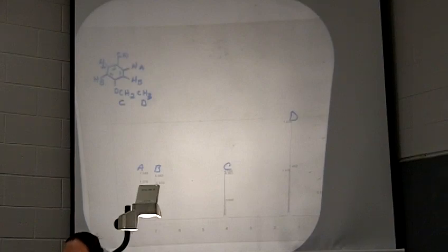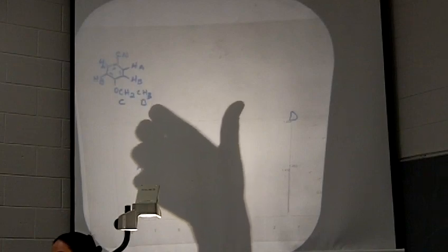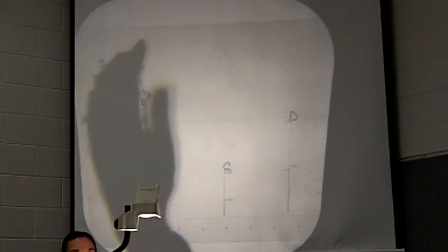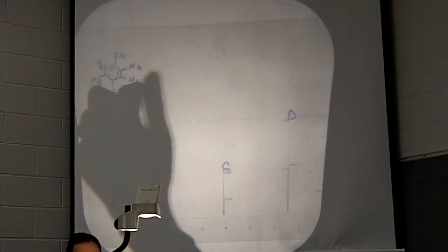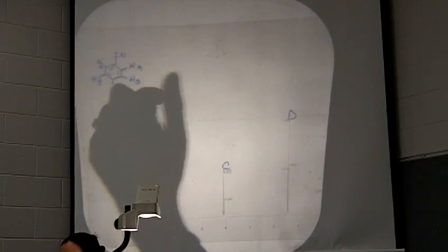That NMR table is what you want to use for analyzing your NMR data. The first column of that table is the letter of the proton. That's what we're talking about as far as the letter of the proton, all right? Okay, the other piece I need to talk to you about is in experiment 16.